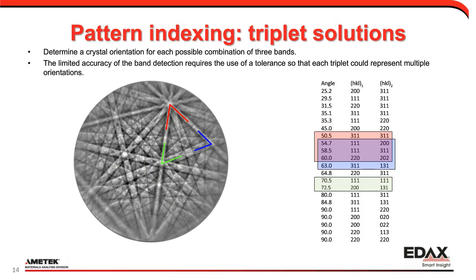So we have in the software what is called the interplanar angular tolerance value. It's used to say, okay, I know this one measured 55 degrees. For the voting algorithm, let's open that up to say maybe it's going to be plus or minus 3 degrees. The reason I said 3 degrees is that it's what we use by default. I will tell you there's almost no reason to change that value in the software.